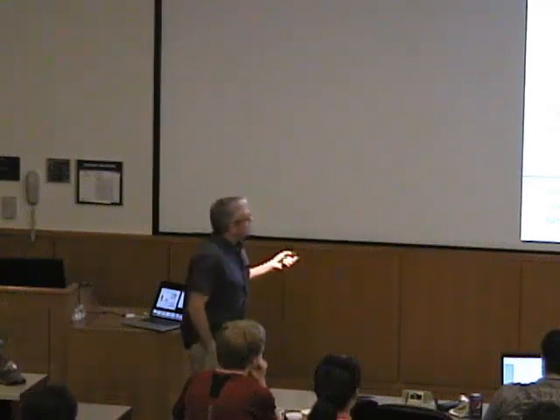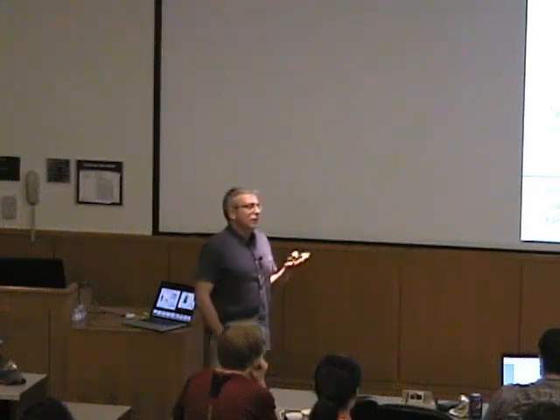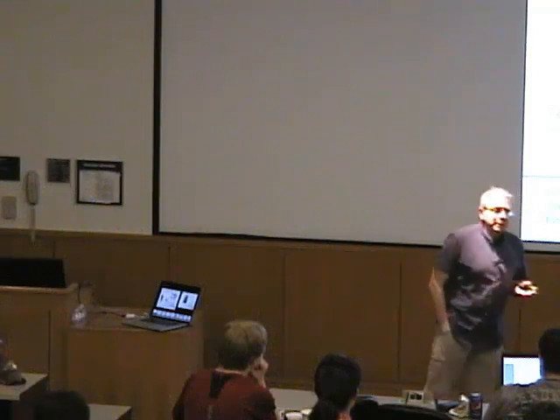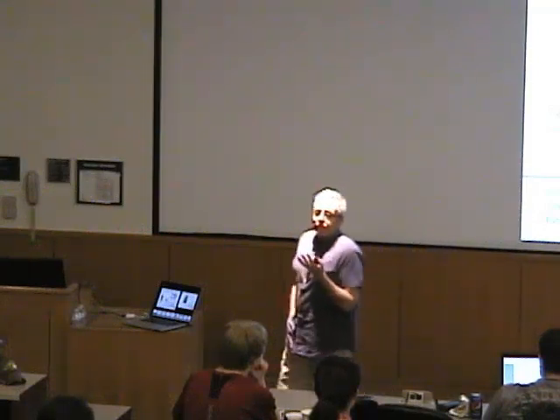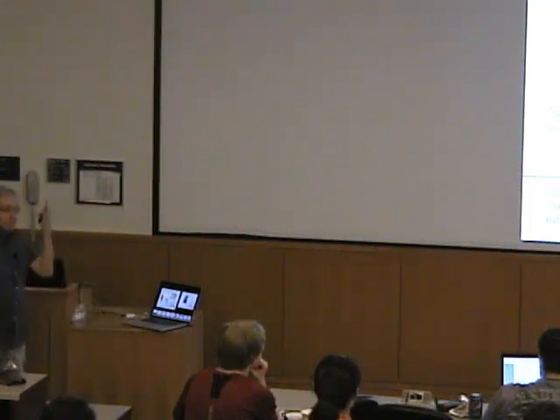There is also the nitrogenase FeMo cofactor. So this is all systems where you don't really know what to expect, right? You want to look at them, and you want to look at them at a level of detail that really tells you at least where every atom is placed in space exactly, or as exactly as possible.